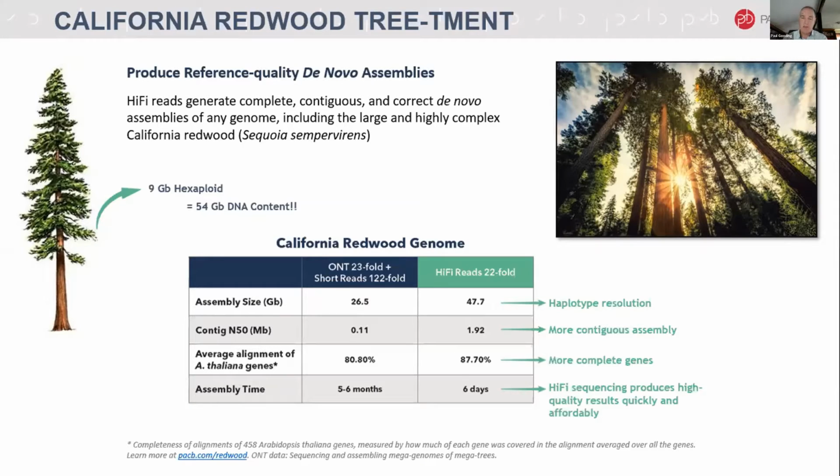But this is where the data is extraordinary, because you've got such long and such accurate reads. You've done this intramolecular consensus on the machine as it's sequencing, so you get small file sizes that can be easily aligned. It cut down from several months of computing to a few days, which I just think is extraordinary.